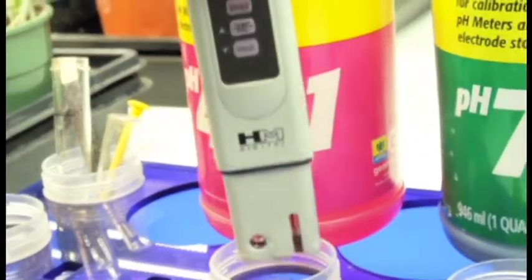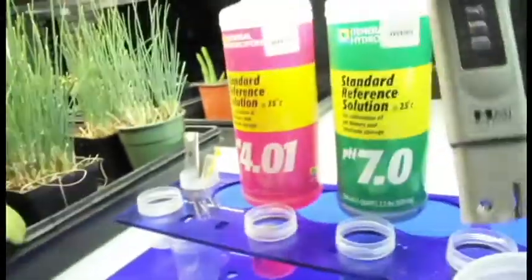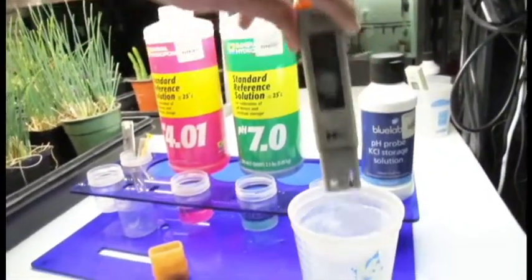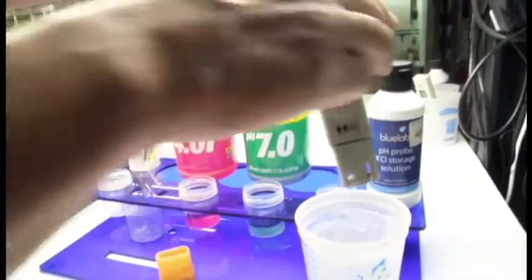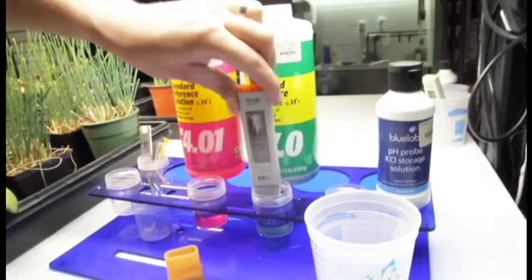I'm going to remove it from the solution, being careful not to let anything drop into my 7.0 that's sitting next to it. I'm going to bring it over to my fresh water and rinse off that 4.0. I'm going to give it another good shake to get those water droplets off. Now I'm going to stick it in my 7.0.